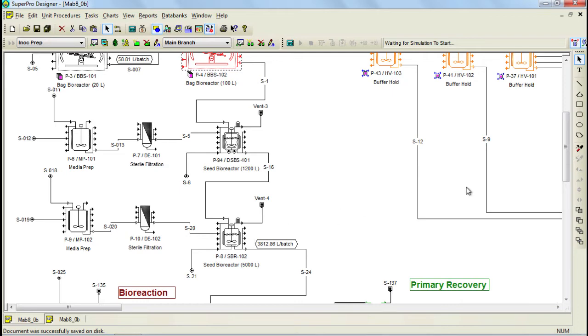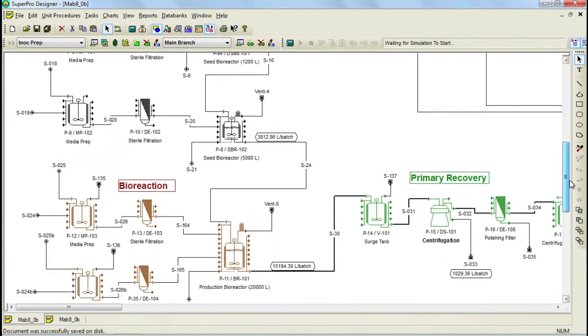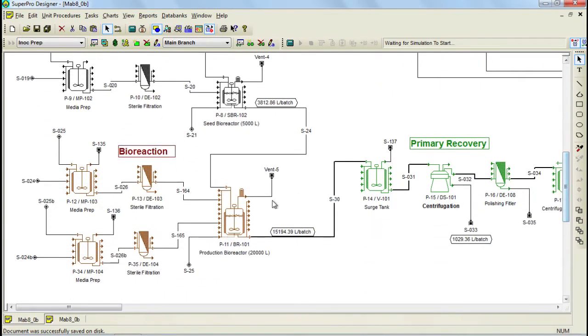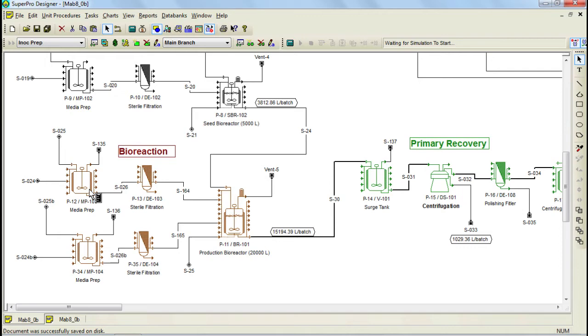Once the inoculum activities are concluded, the broth is then transferred to a 20,000 liter bioreactor, already containing sterile media which has been previously prepared through this unit procedure. The production bioreactor operates under a fed batch mode. The media used during the fed batch operation is prepared through this unit procedure and sterilized using a dead end filter.